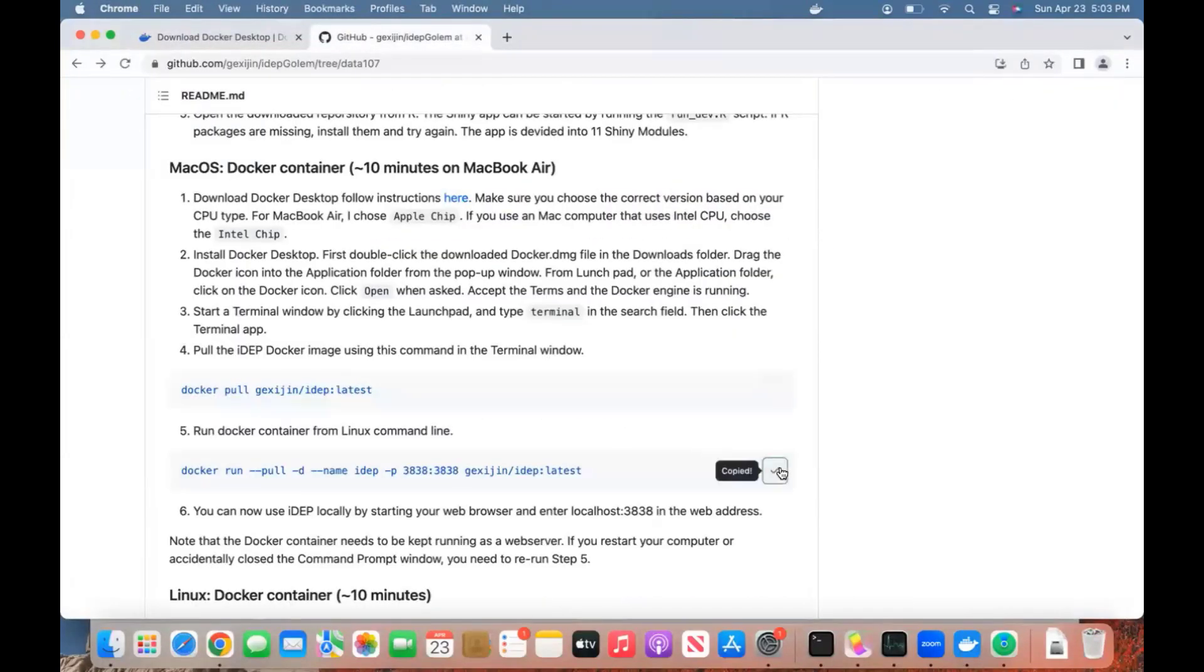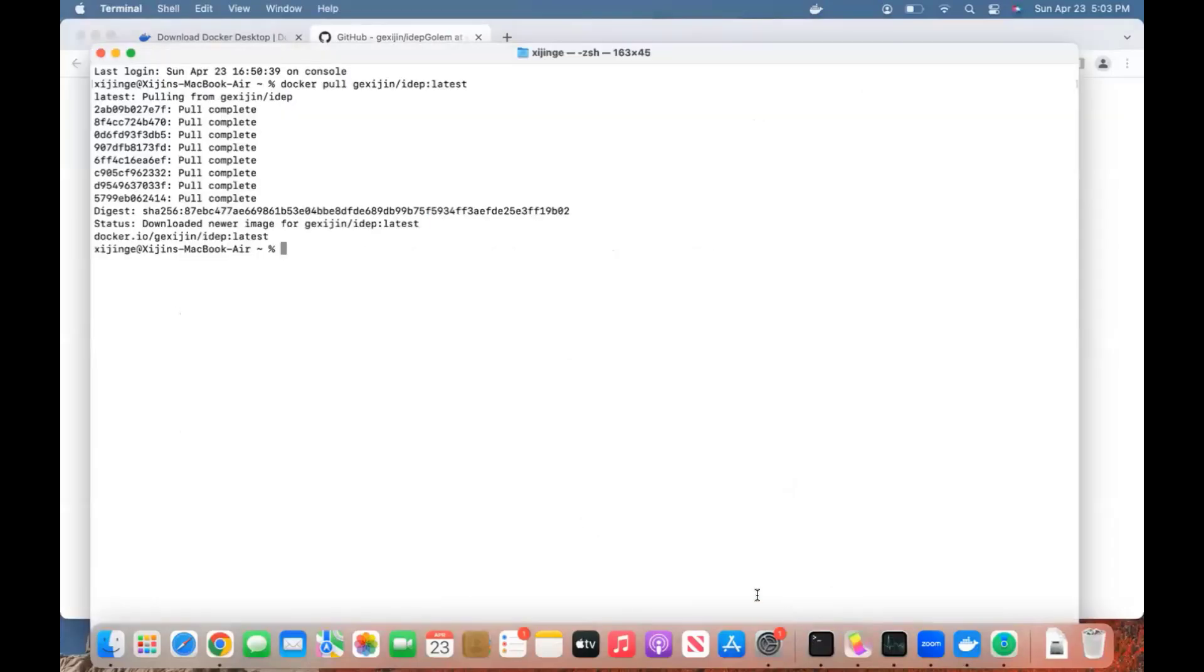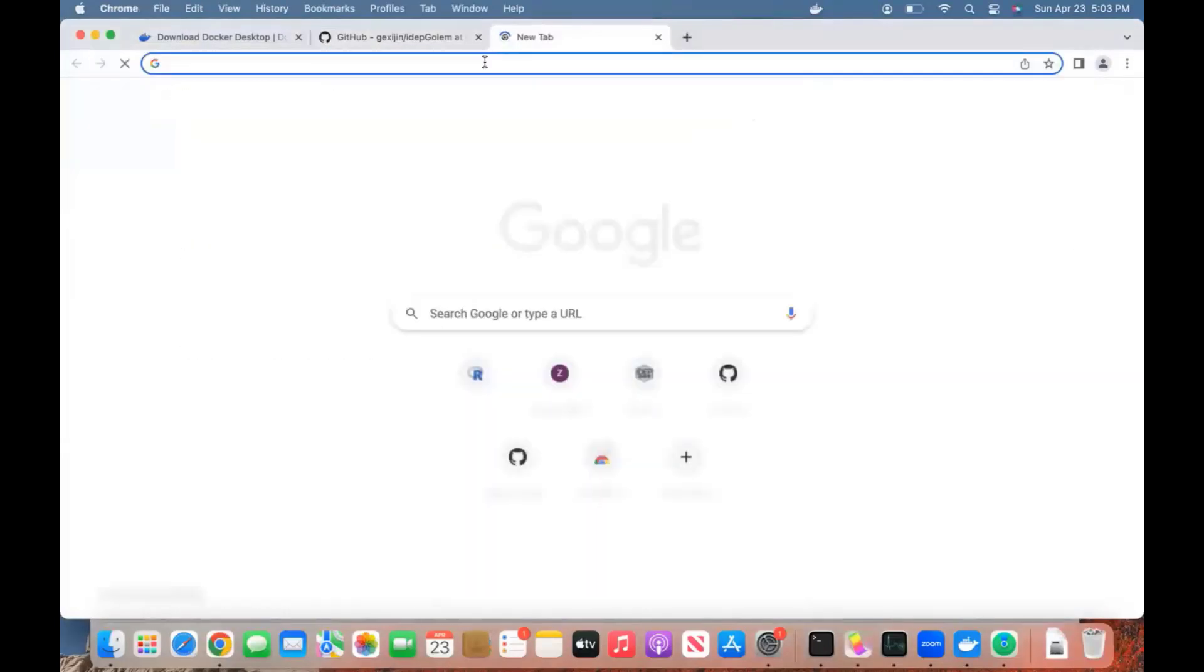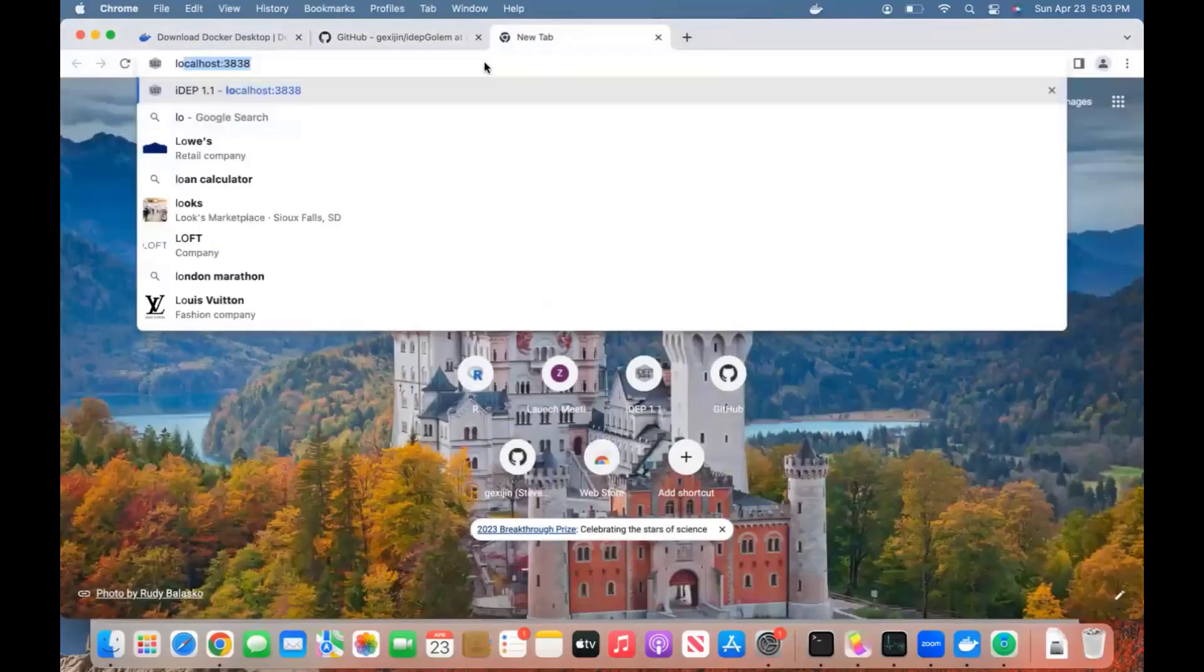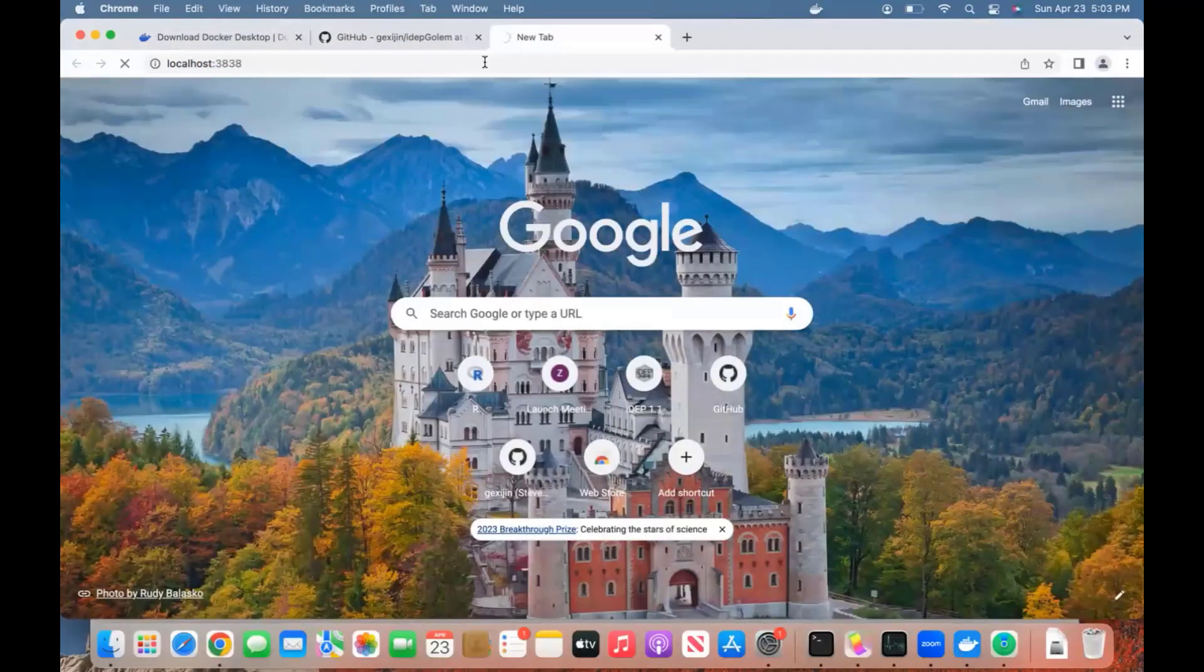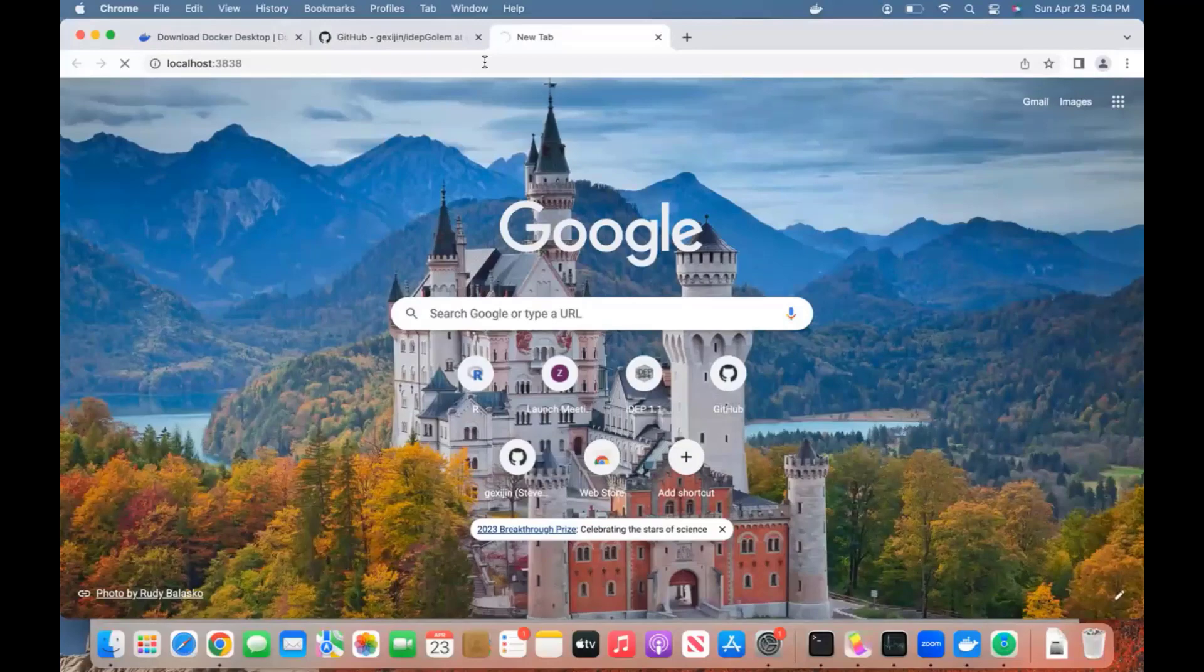Copy this line of code and come back here. It's starting to listen. Now we can come back to the browser at localhost 3838. For the first time, it takes a little bit of time, so just be a little bit patient.